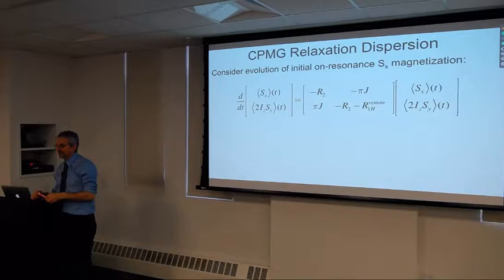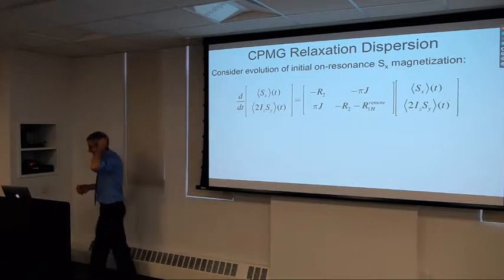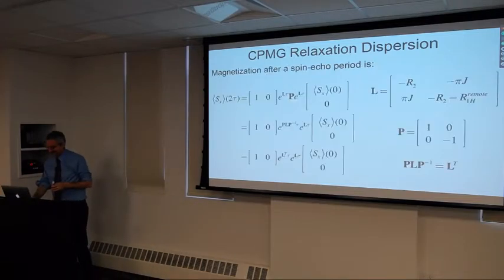The problem was clear enough that when I was a postdoc, I wrote a paper that said we could never use the CPMG experiment for studying chemical exchange in proteins because of this effect. So I set the field back for a decade.